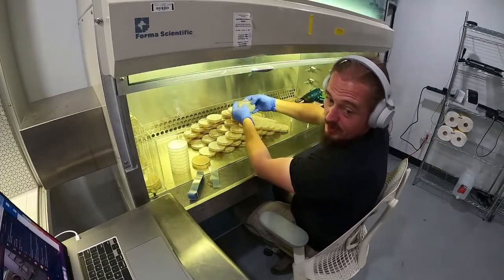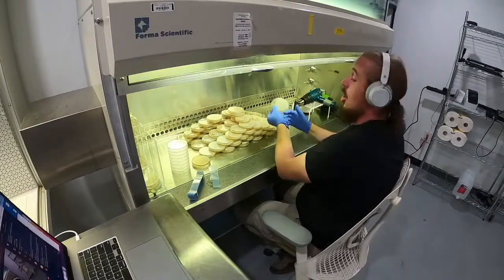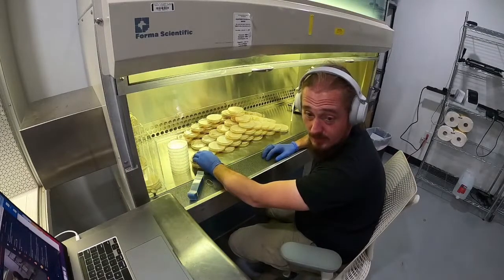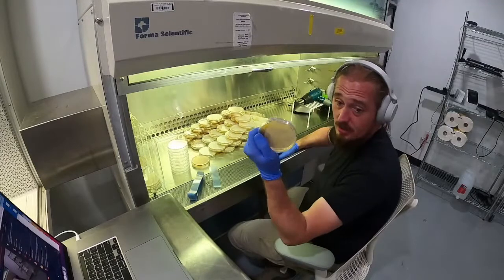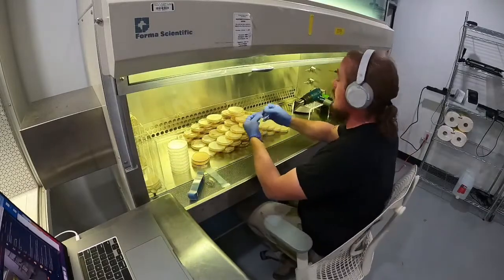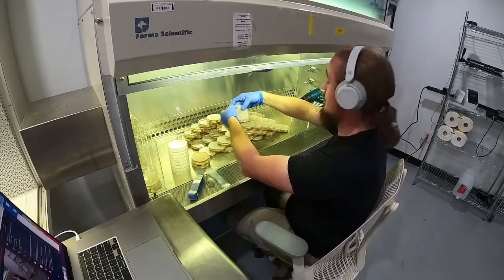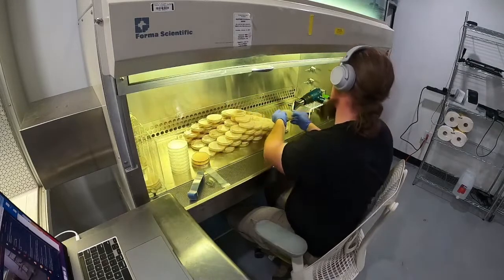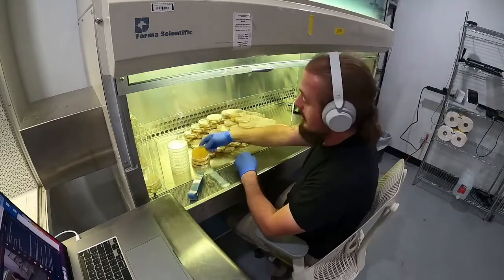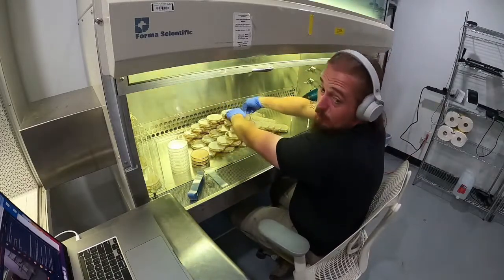What's the benefit of inoculating LC versus agar? That's a great question. Okay, so agar. I love using agar for everything, right? The reason I love using agar is because if I look at an agar culture, I can generally tell just by looking at it whether or not it's contaminated. However, using an agar plate on a 3-pound bag of grain isn't optimal because it's not a lot of biomass, right? You've got maybe 16 milliliters of agar in here versus, say, a liquid culture, which would be 10 ml of pure living biomass.